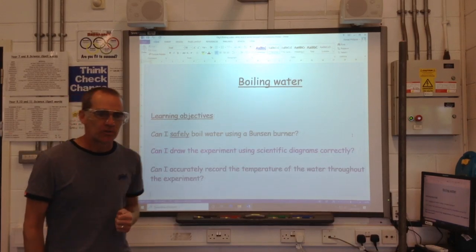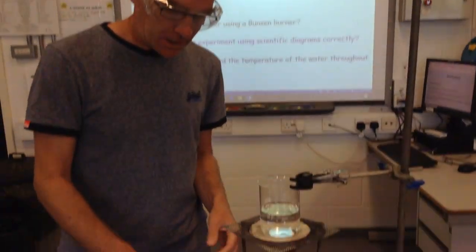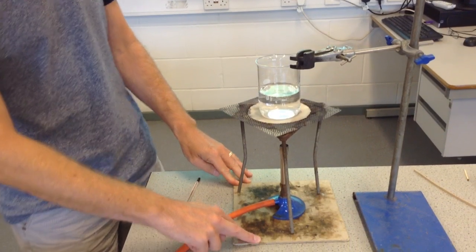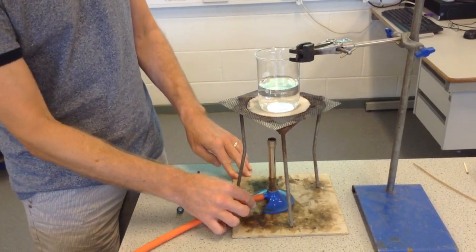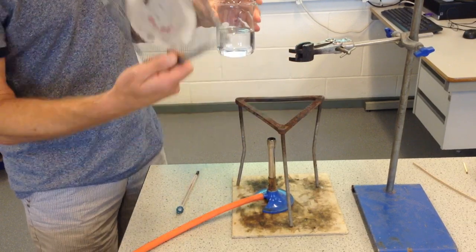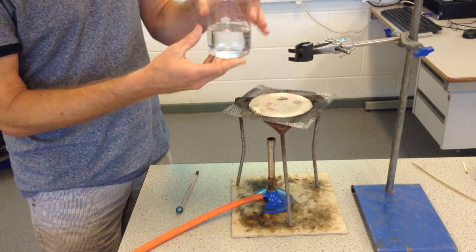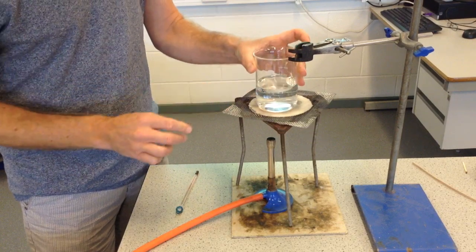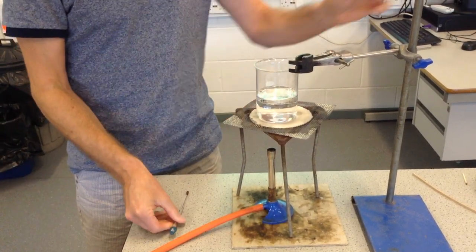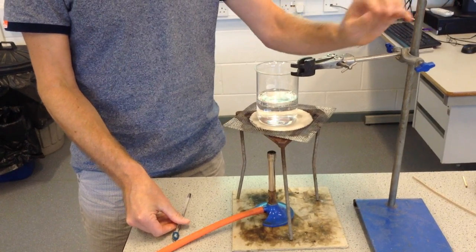So the setup is here. Let's just go through what equipment we've got. We've got the heat-proof or safety mat, Bunsen burner, the tripod, a gauze, a beaker which has already got water in it. I'll be using a thermometer, and we've also got here a clamp with a stand.